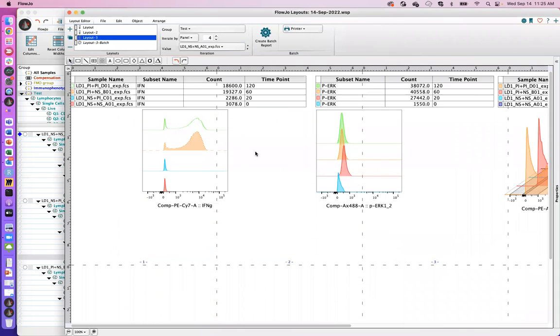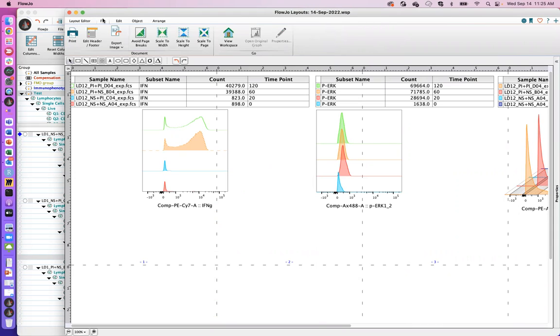The other thing you can do is you can say, oh, you know what? I don't really want to deal with patient number 1. I really think that, I don't know, patient number 12 is the optimal patient. I want to show this patient set of graphs for my figure. You can select patient 12 from the staging area that you set up here. Then you can go to File and then just say Export Image, and you can export this as a TIFF, an SVG, or a PDF.